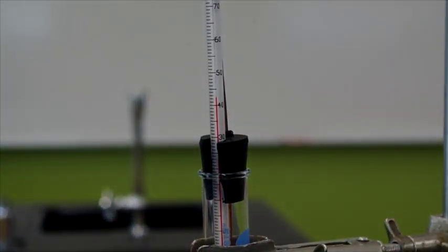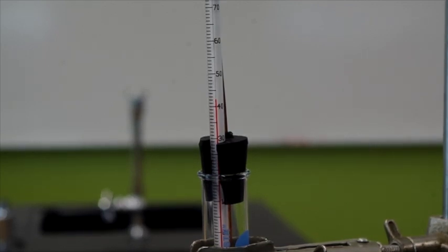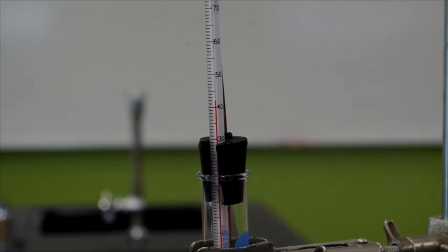So we're at 42. I'm feeling it's going to start solidifying soon.